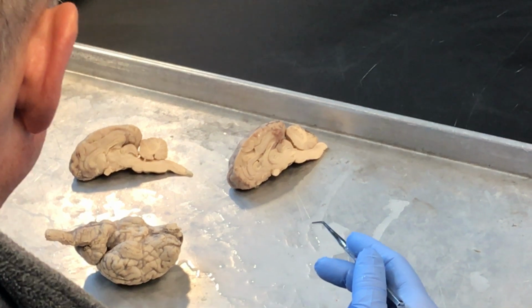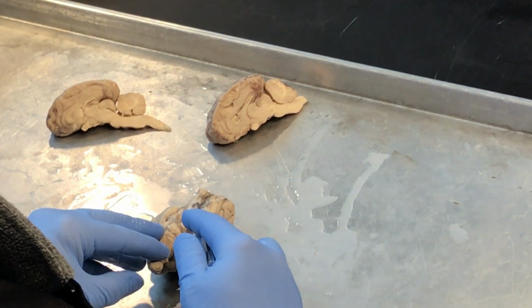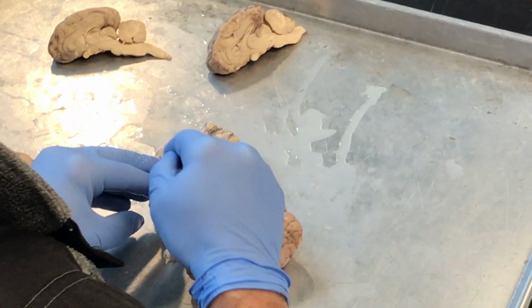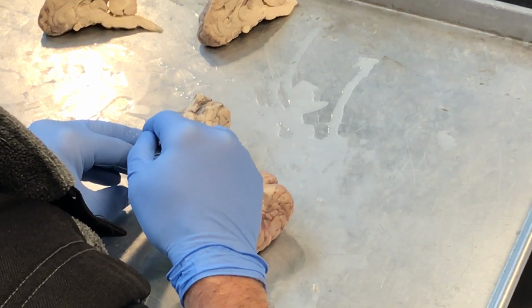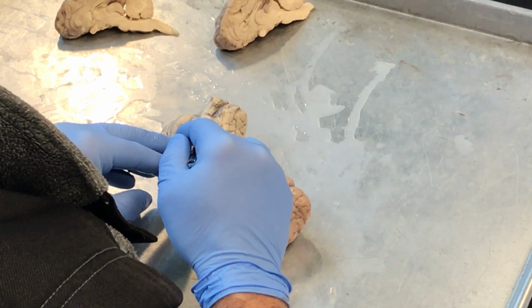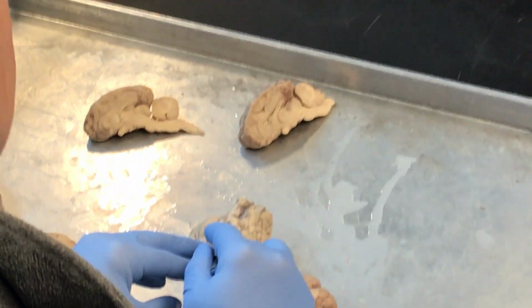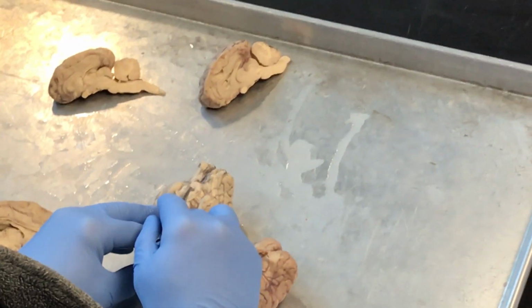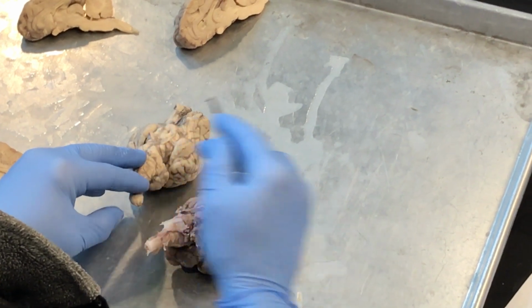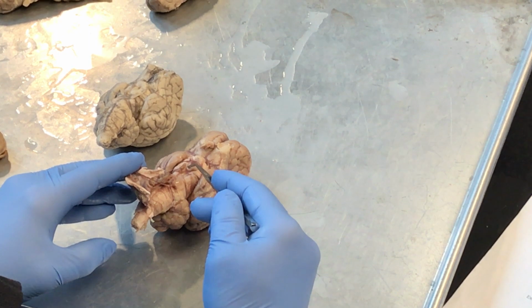You'll see it better from this perspective. So here's your optic chiasm. Hypothalamus is down in this area right here. Okay? And these, by the way, are the trigeminal nerves. See how small they are? They're relatively big nerves, but they're still very small and very fragile. So optic chiasm, and then the hypothalamus is in here, and these are called the mammillary bodies. Same thing if we pull this back. Here's optic chiasm. This is mammillary body right there.